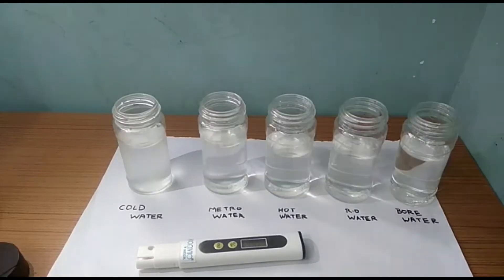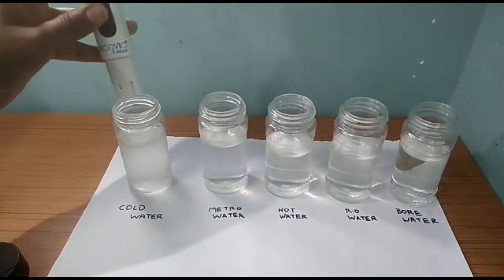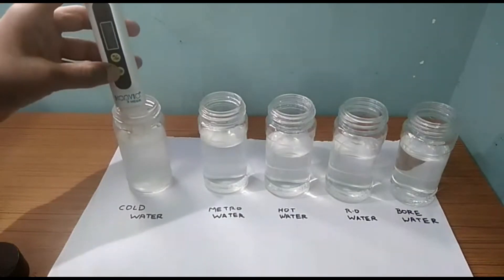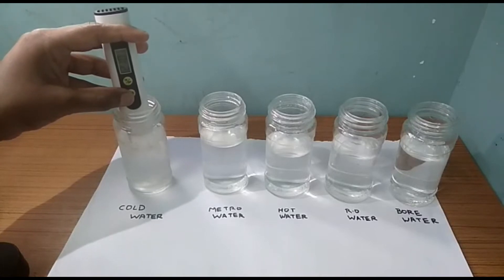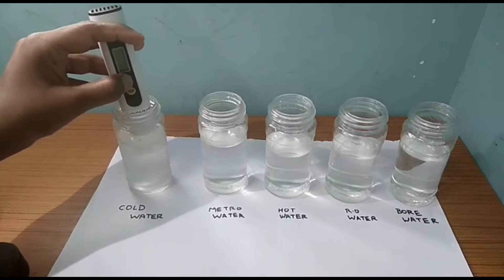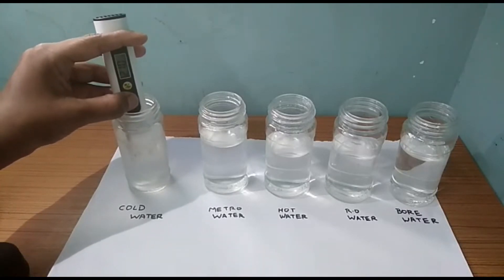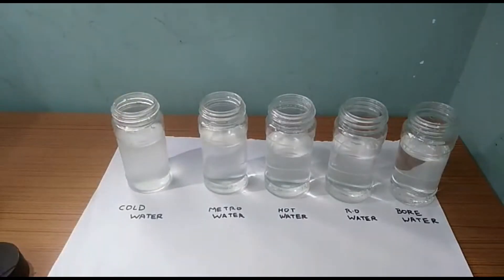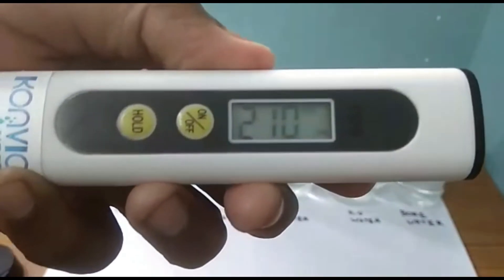Now we will check in the cold water. We will press the hold button, then click the off button. Let's read the reading — it's around 200 to 300. So that's an excellent value.